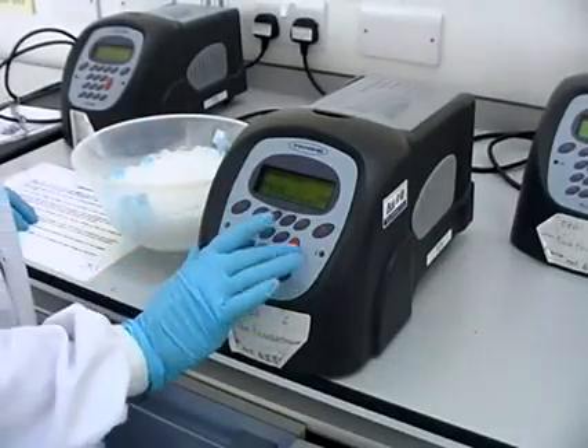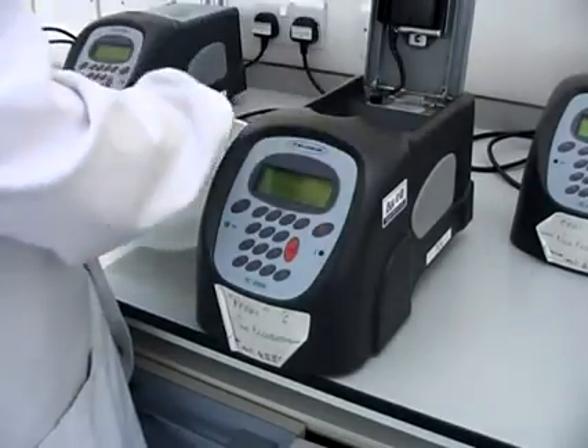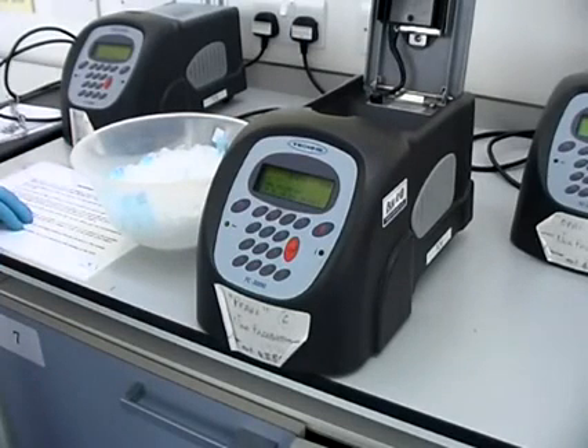This process takes place over 30 cycles and the final extension is at 72°C for five minutes. Once cycling is complete, the samples are removed from the thermocycler and placed on ice. They are now ready to be run on an agarose gel, or can be placed in the freezer until ready to be run.